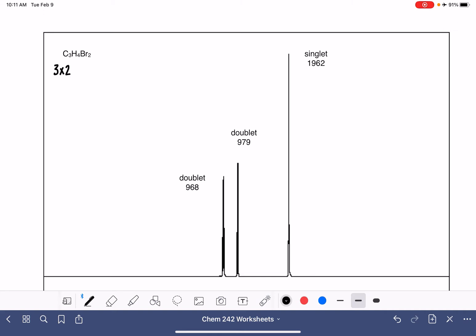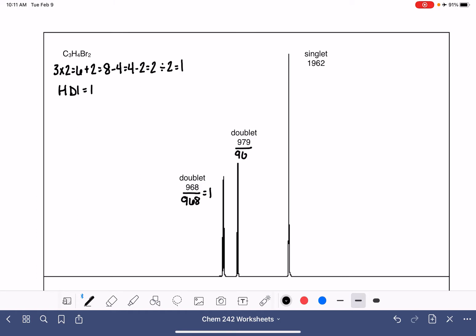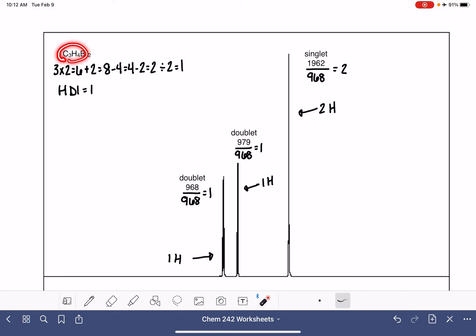For our next molecule, C₃H₄Br₂: 3 times 2 is 6, plus 2 is 8, minus 4, minus 2, giving us an HDI of 1. So we have a double bond or a ring. Now let's check our integrals. Our smallest number is 968, corresponding to one hydrogen; another 968 is another one; and a third value is probably two. So we have one hydrogen for this peak, one hydrogen for this peak, and two hydrogens for this peak — 1 plus 1 plus 2 is 4, consistent with the formula.